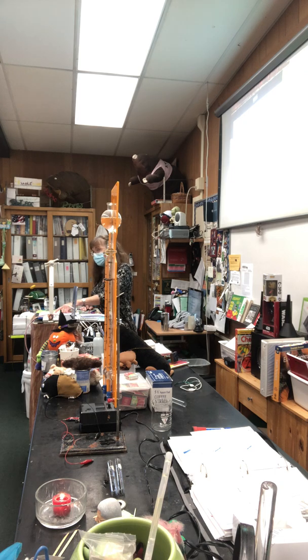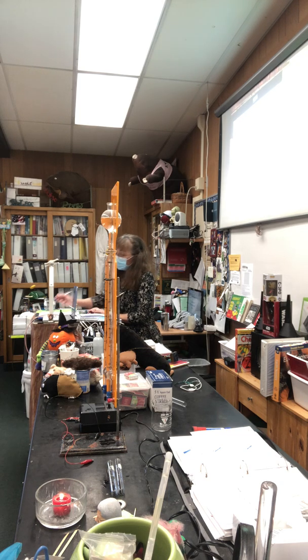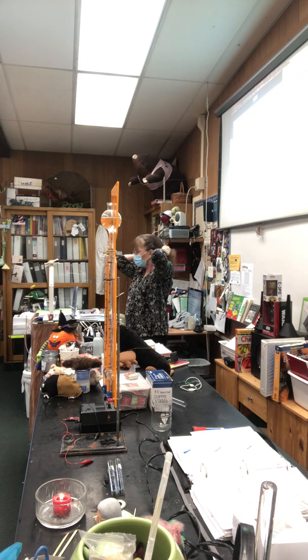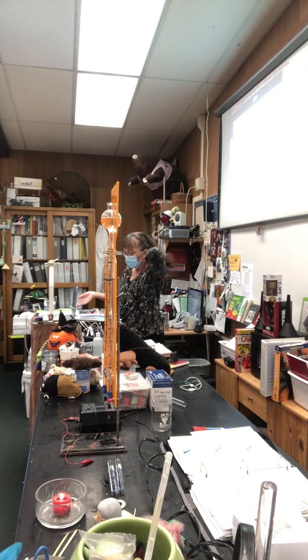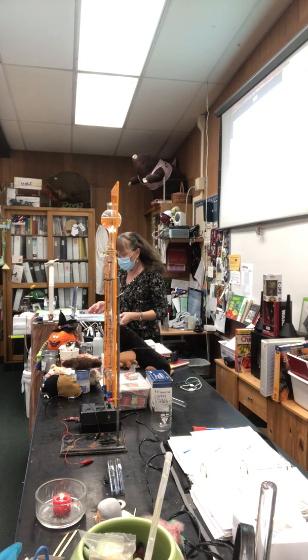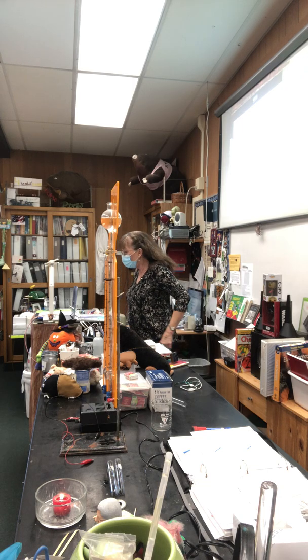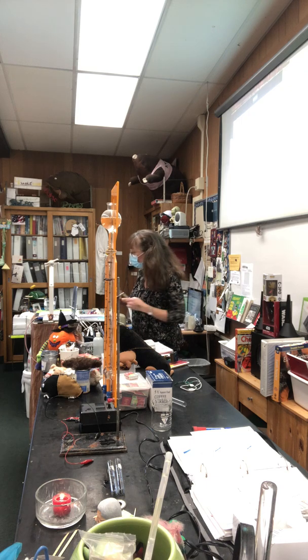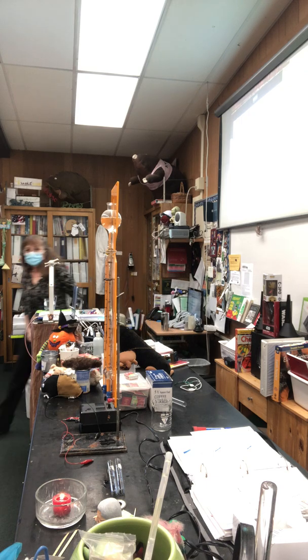Right? These are called subscripts because they're below the line, and they just tell you how many atoms of that element are stuck together. All right, so that's the process that we're going to do, but it takes energy. So we have to run electric current through the water in order to make this happen because water doesn't want to come apart. And so that coming apart is an involved process that we're going to need to use apparatus to do.